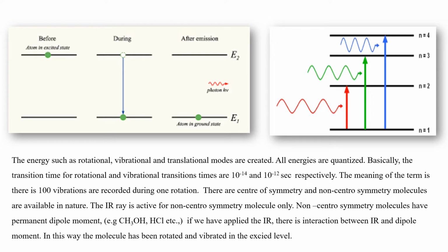Once again, it comes back to the ground state. But during that transition, a small emission is possible. That is recorded from the orbital or excited level, which gives all the information about the excited level of that molecule. In this way the absorption spectra are developed.